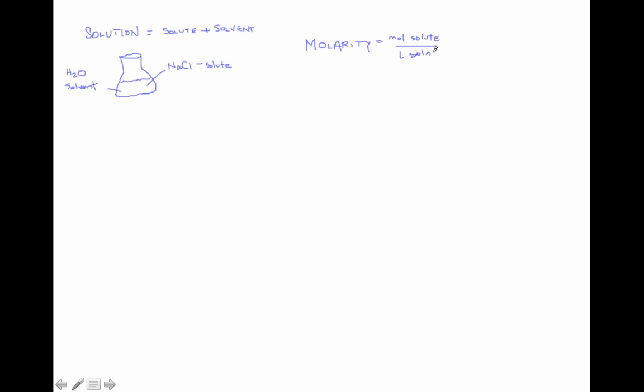I abbreviate solution SOLN. Alright, so let's practice with this. Let's suppose this is our solution. Sodium chloride has a molar mass of 58 approximately. Okay?